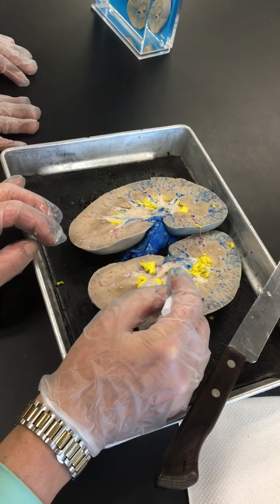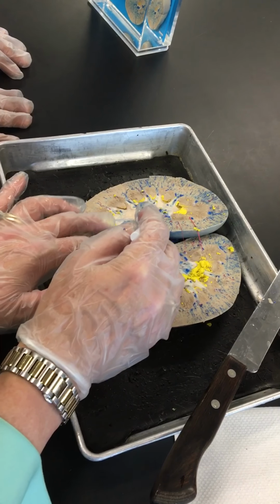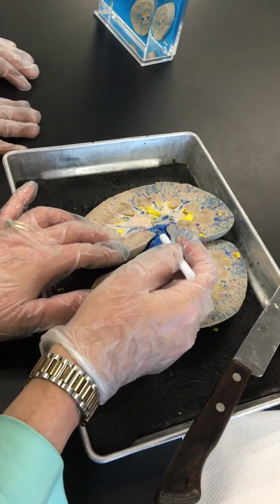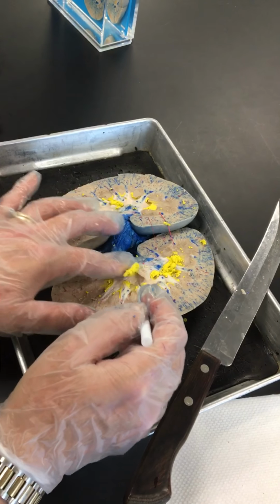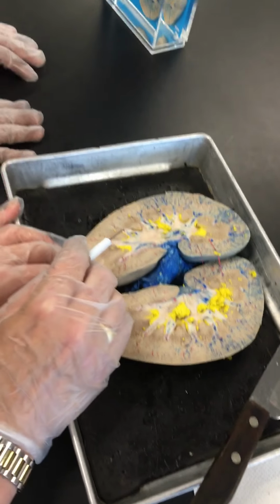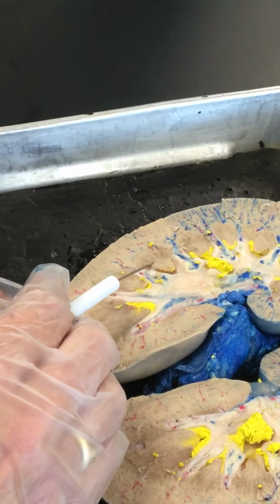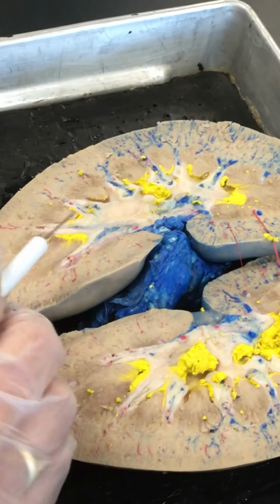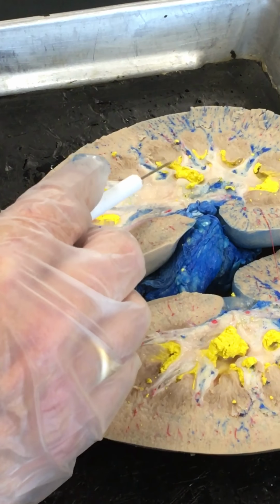Where the calyces all merge together is the renal pelvis, and that's going to form the ureter inside of the kidney, and that's then transporting the urine to the urinary bladder. So the renal columns are going to be the white connective tissue between the renal pyramids, which have the collecting ducts and loops of Henle in them. The collecting ducts enter into the calyces.